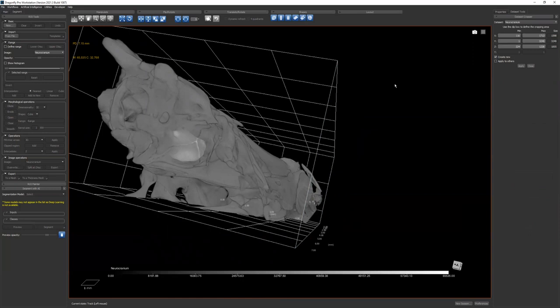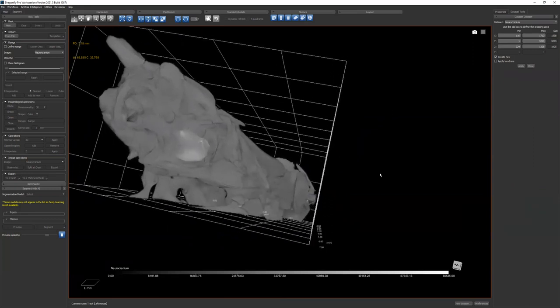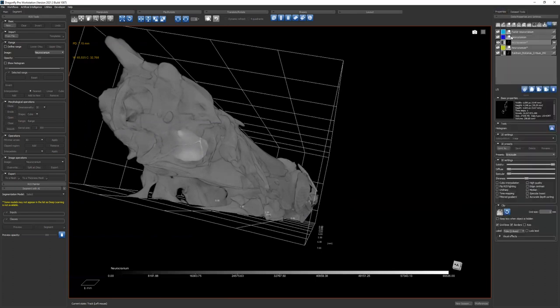But I've noticed that quite often the crop fails for whatever reason, and it leaves you with a volume that has some error. It has a question mark where this icon usually is, or an X, and it's just unusable after that. And then you have to start over.